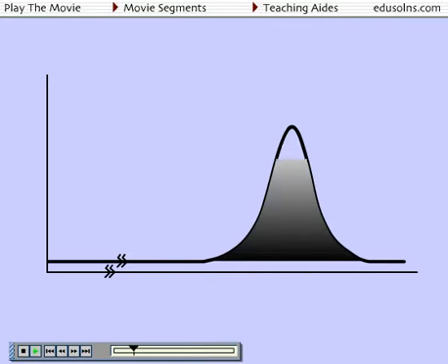First, when baseline resolution is achieved, the integration process is relatively straightforward. Tick marks are sometimes used to show where the system starts and ends integration. But what happens if you have what appears to be baseline resolution, but the baseline of the chromatogram has been elevated as shown here? How will this affect the peak area?